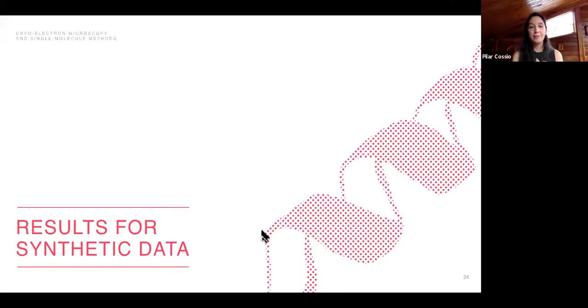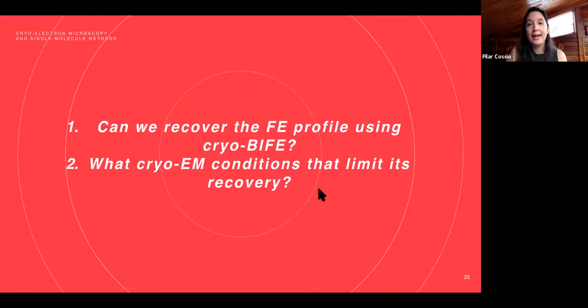Okay, so now I'm going to talk to you about some results for synthetic data. The questions that we want to answer are, can we recover the free energy profile using this methodology? And if so, under what conditions? What are the Cryo-EM imaging conditions that limit its recovery?